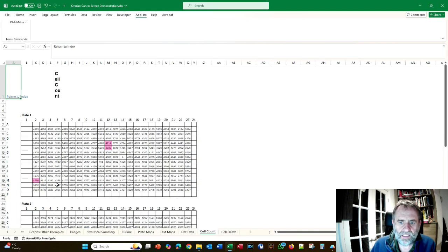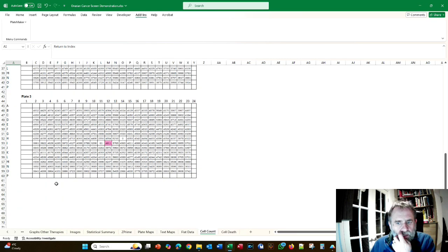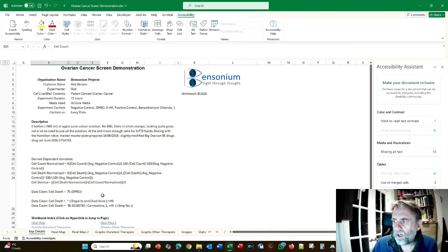So that's it really. So the good news is we've pretty much done 2 fairly big exercises to really get to know the Platemaker Wizard inside out in terms of all the functionality it offers you after you've built a container workbook. So I hope you have enjoyed this tutorial.